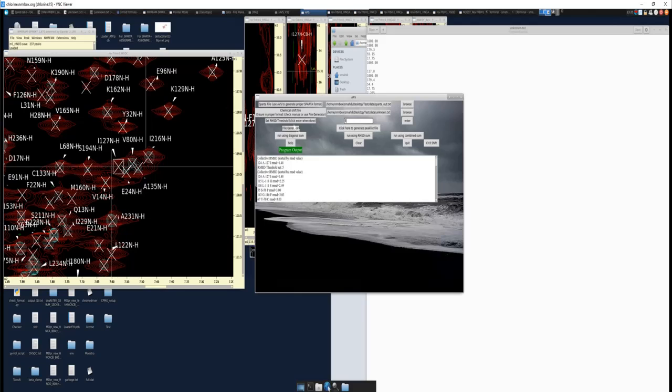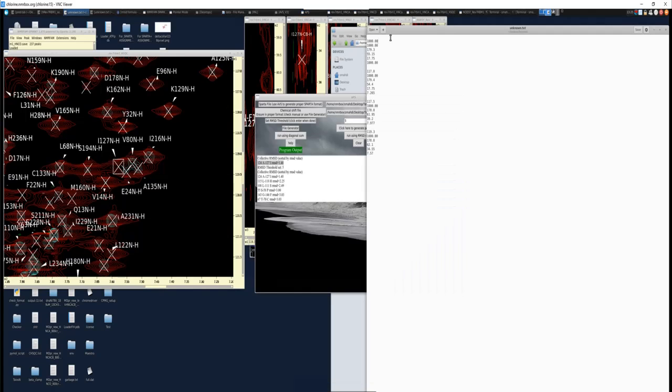And now you know that this is amino acid 124 through 127, right? So this would be amino acid 124. This would be amino acid 125. This would be that phenylalanine 126. And this would be isoleucine 127, right? So this can be used in this manner to assist in your assignments. But we can take it actually one step further as well.